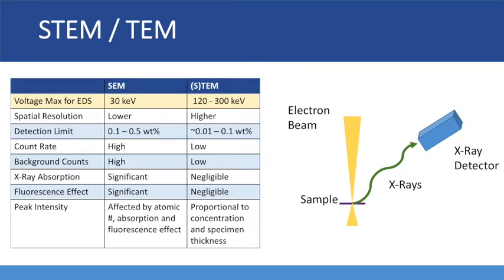Just a few of the most important examples are given on this table. Because of the setup of the STEM, you can detect the entire range of X-rays due to the voltage maximum being able to reach almost 300 keV. While transmission microscopes can go as high as 300, it's only realistic to generate X-rays up to 50 keV.